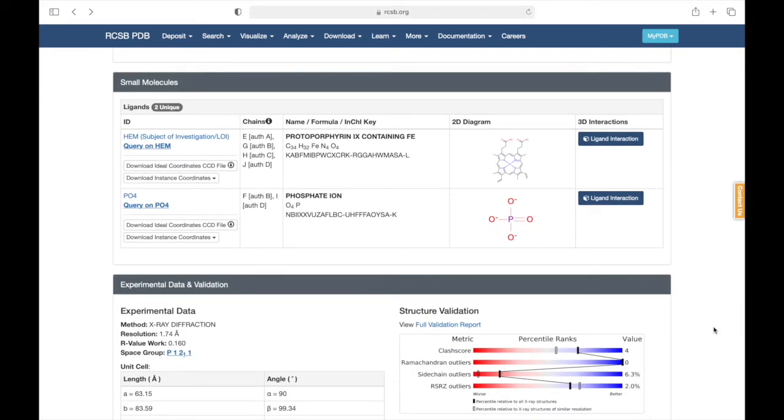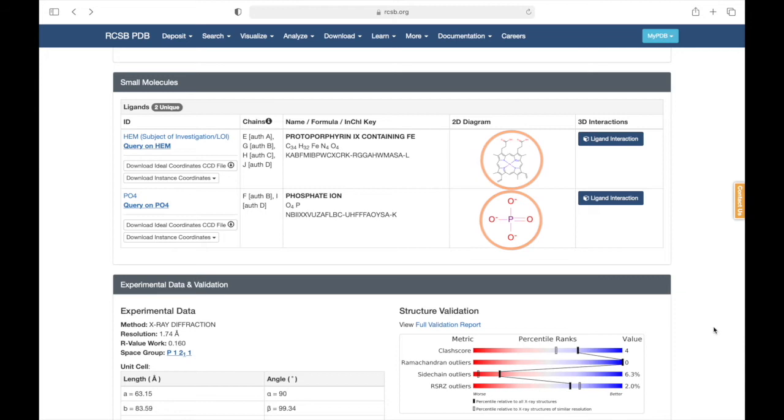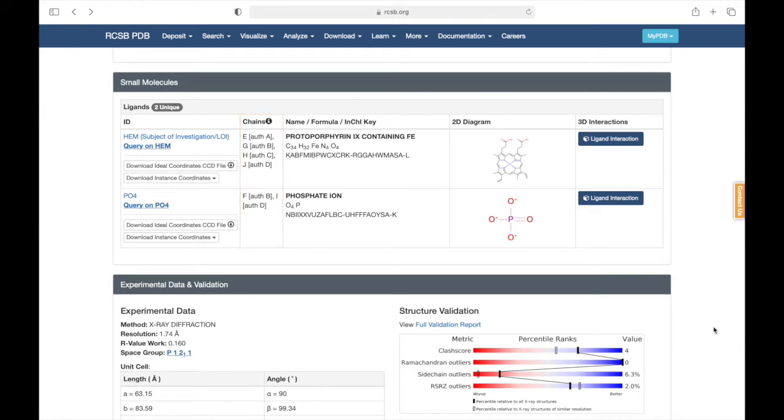This section provides a list of ligands that interact with the protein chains but are not part of them. The ligands for this protein are heme and phosphate. The table provides helpful information such as which chains the molecules interact with and their abbreviations, which you will see in Chimera in a moment.